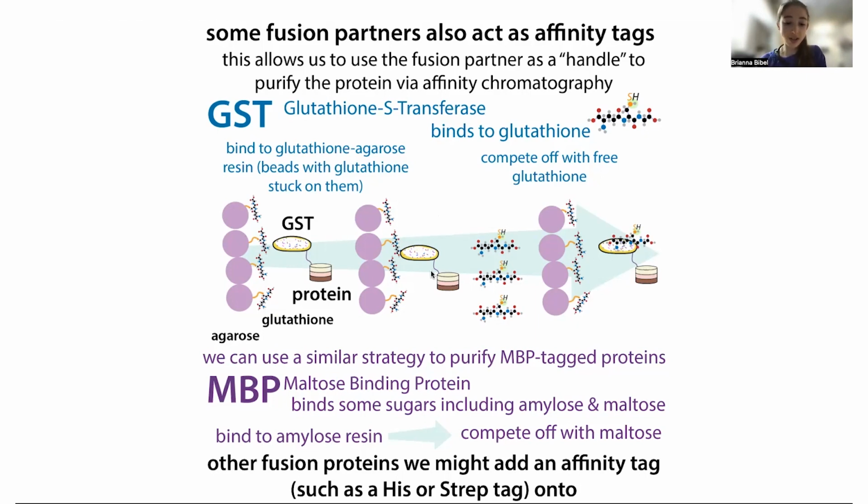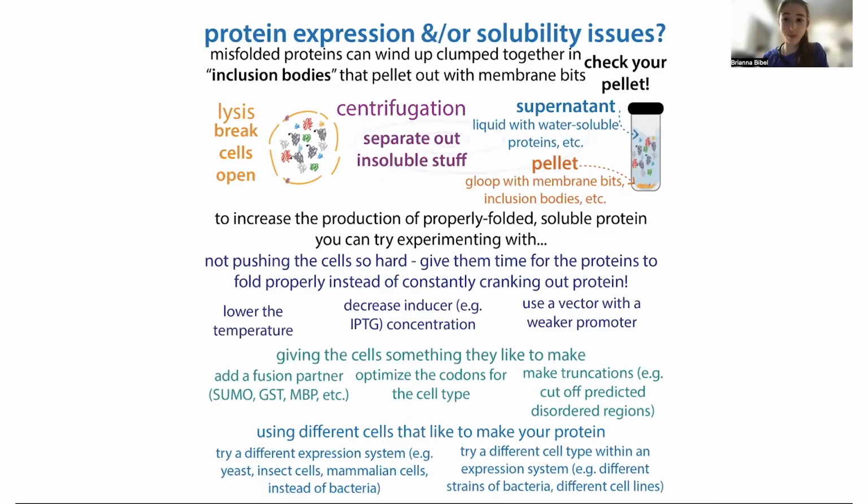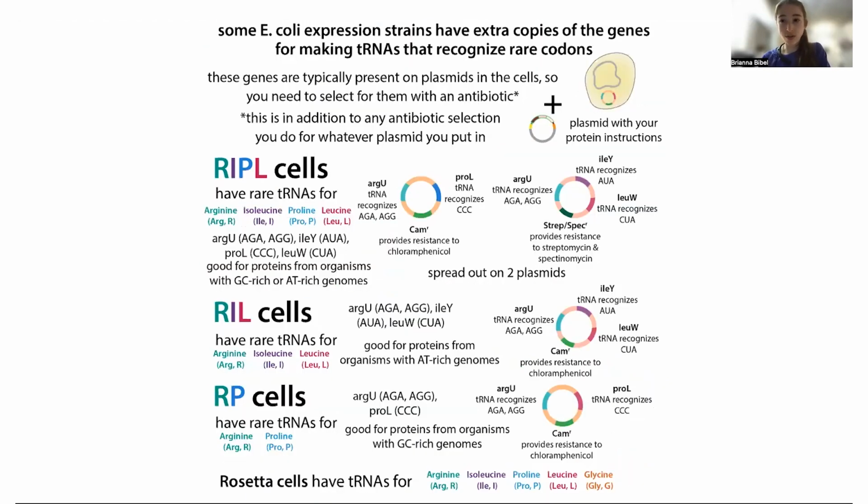And so you might actually need to try different fusion partners. If you're having trouble with the expression, you can try different fusion partners. You can try changing the linker. And these are just a couple of strategies using fusion partners, but then there's a ton of other things that you could do if you're having problems with expression or purification, and much more on that in my troubleshooting post. And things like codon optimization, using different strains of bacteria for bacterial expression, all sorts of things.